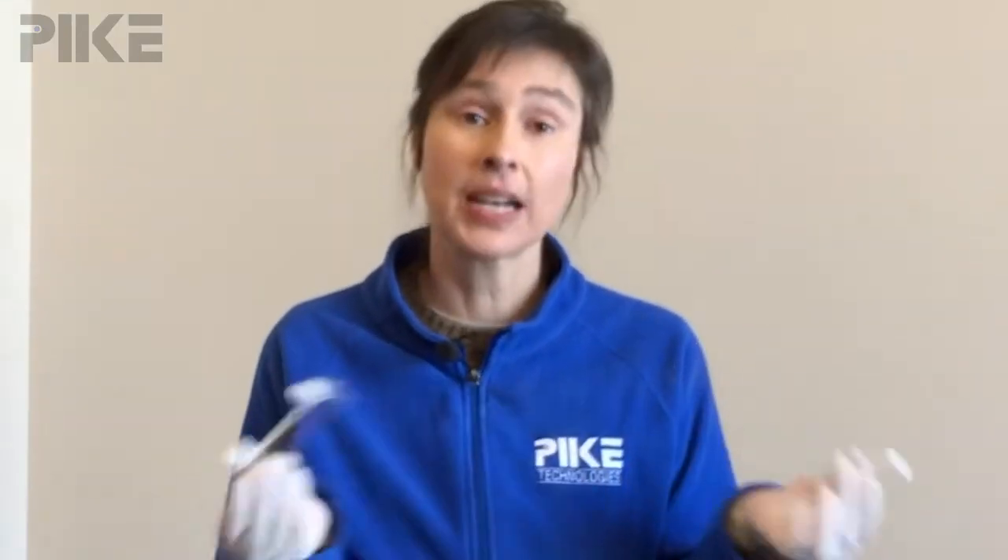You make a measurement in the mid-infrared region where you quantify on the CH stretch area. These cells come in different path lengths so you can optimize your results. The oil and water application isn't the only use for these.